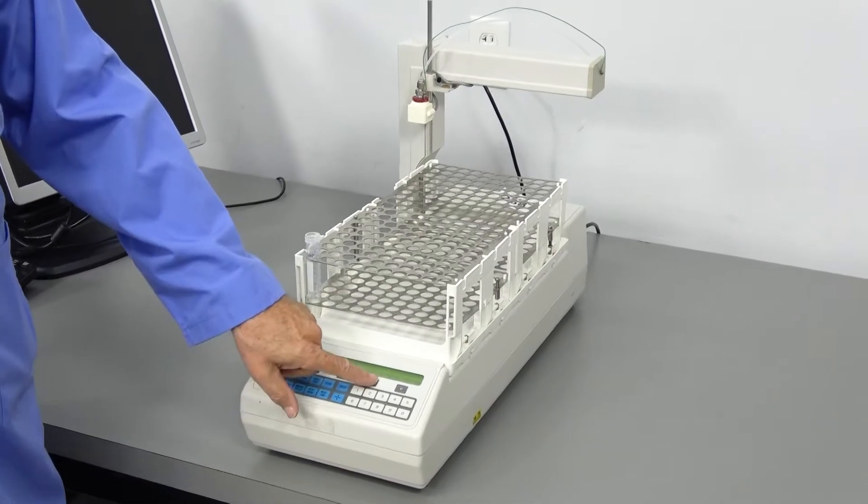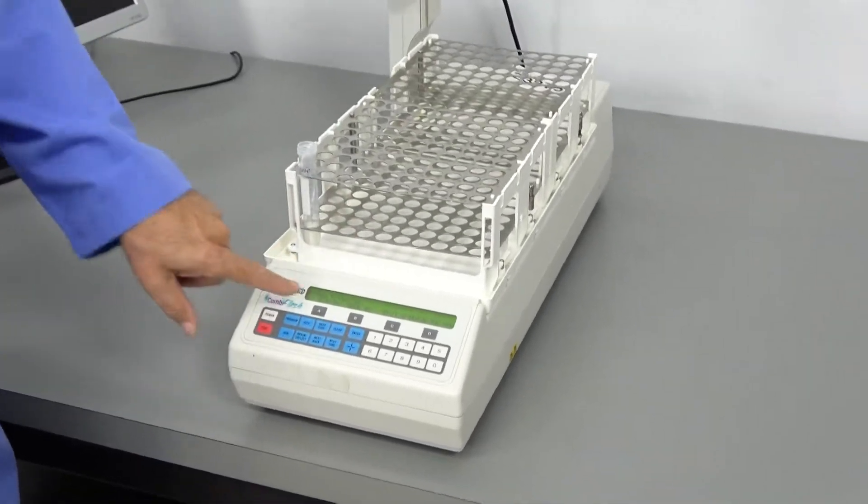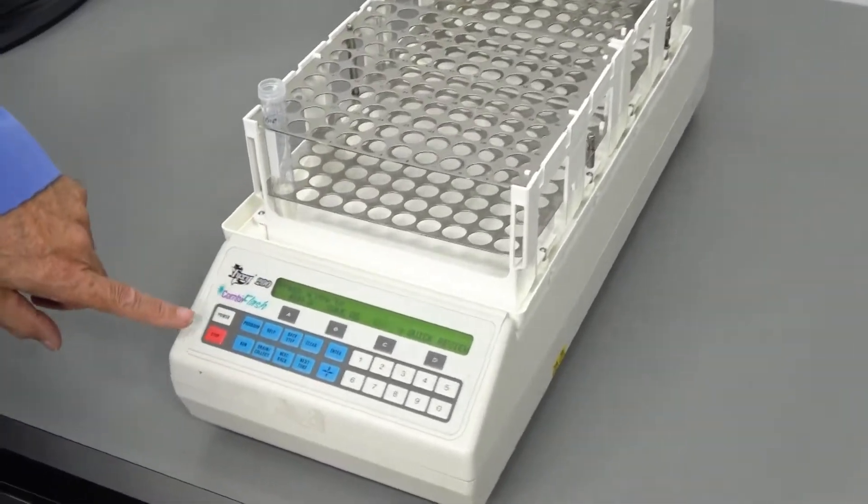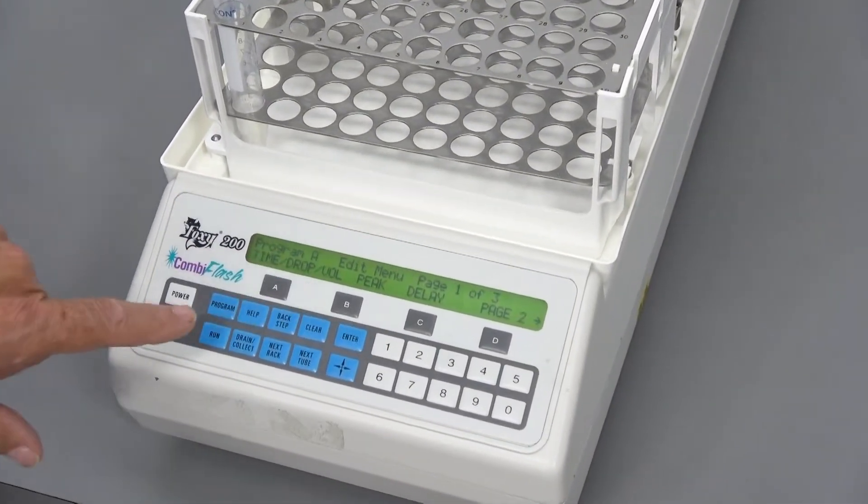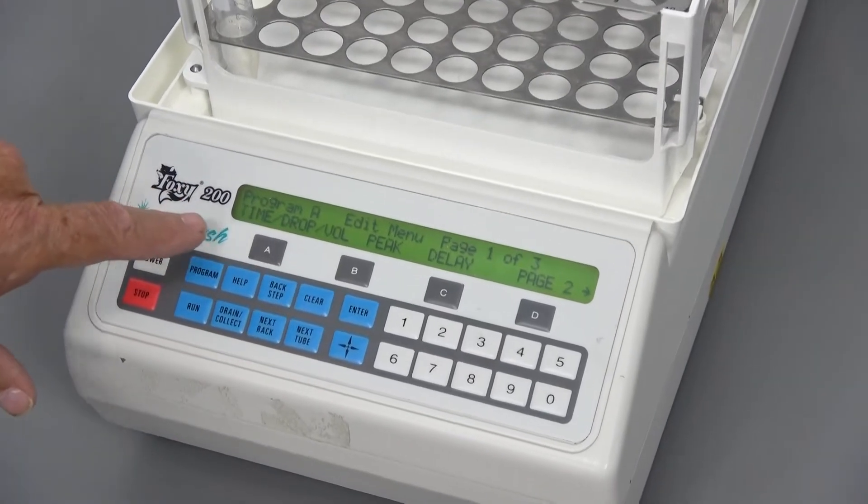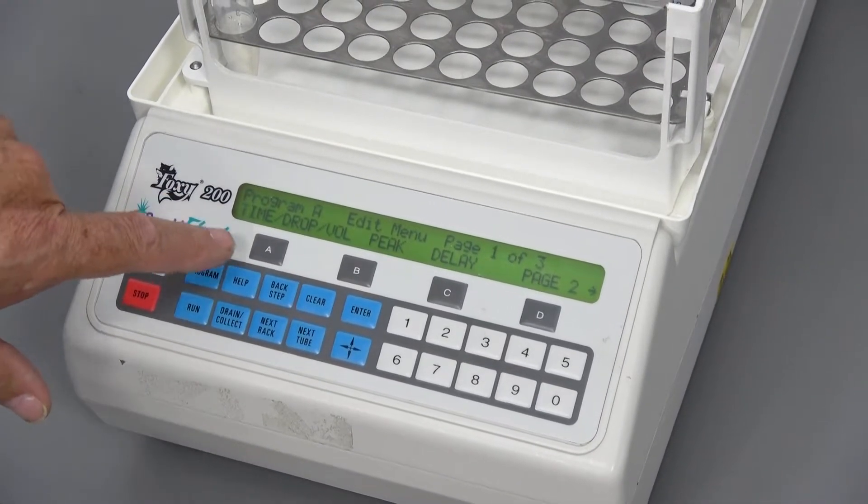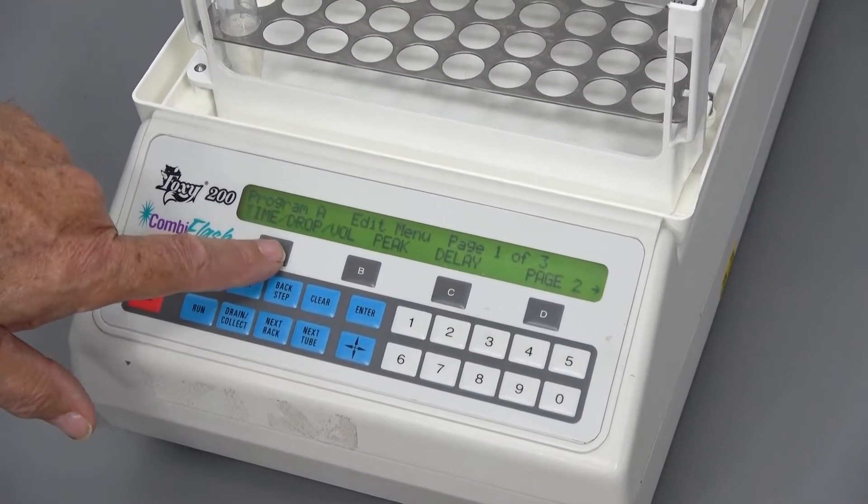In this case, we would just tell it that we want to edit the program that we have currently up on the screen. Select to edit. Here's where we tell it what we want to edit. This we're going to, the time drop or volume property.